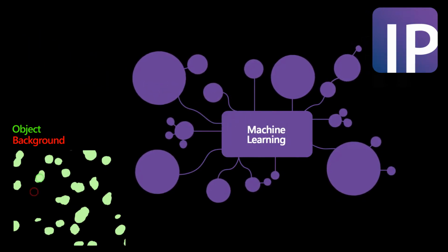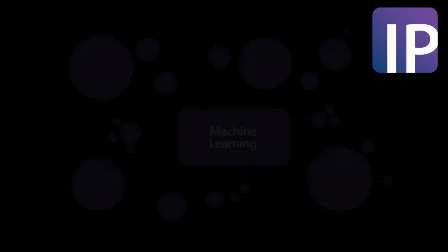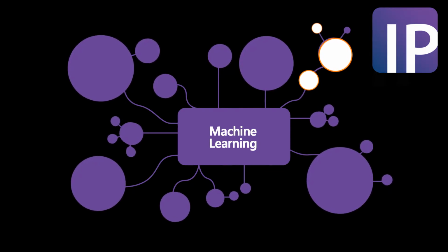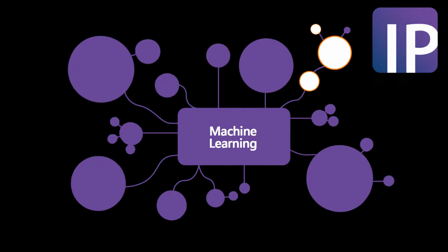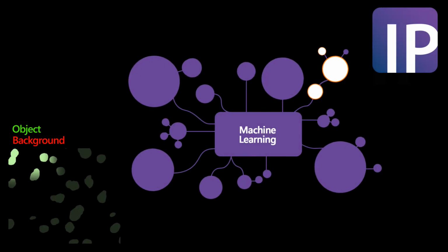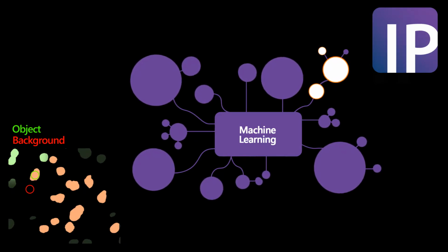Not only does this vastly simplify the segmentation process over other methods, it is also a highly flexible system that will address the most complex segmentation, as well as adapt to slight variations across specimen types, sample preparation, and assay results. Smart segmentation is also a trainable learning algorithm that can be easily refined with successive images by simply selecting additional areas of interest for the objects or the background.